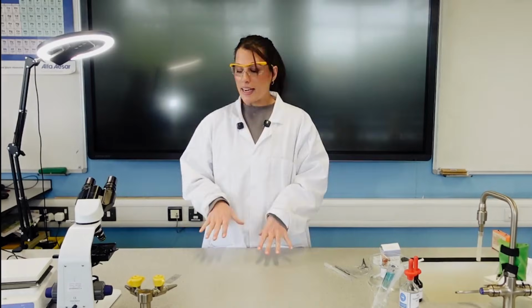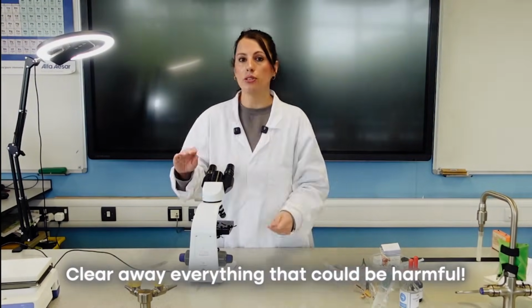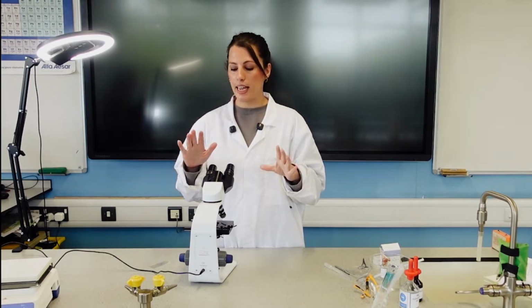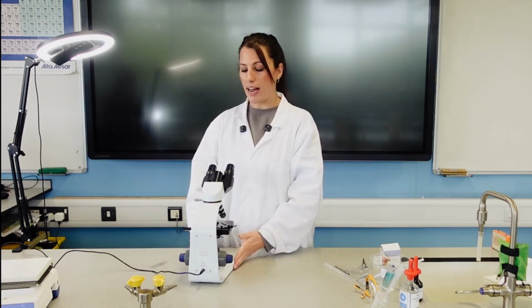So now we've made our slide, we're going to mount it onto the optical microscope and see, can we actually find any cells undergoing mitosis? I would get the students to clear away everything that could be harmful. So clear away the stain, the acid, and all of that at this stage. So we now just have our slides. They can take off their goggles looking at the microscope.